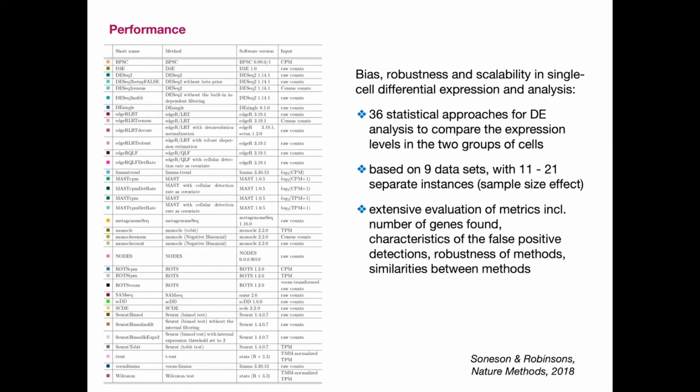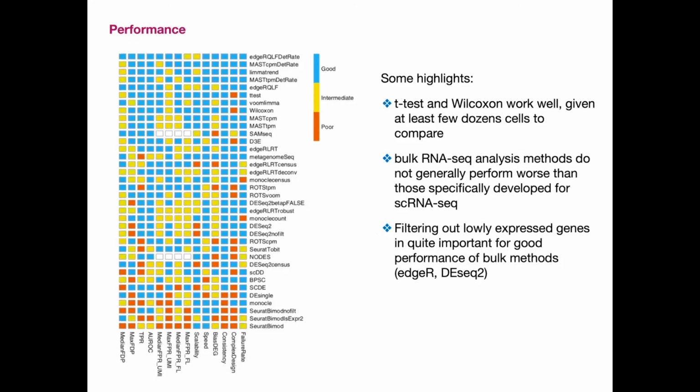There is one paper that tried to do quite a lot of different methods. It's a while back, but I think several of these are included in Scanpy, and then also based on different normalizations before doing differential expression and so on. So it's quite an extensive comparison. And they tried then to rank all these methods on good, intermediate, and poor as a sum from all the different tests they did.